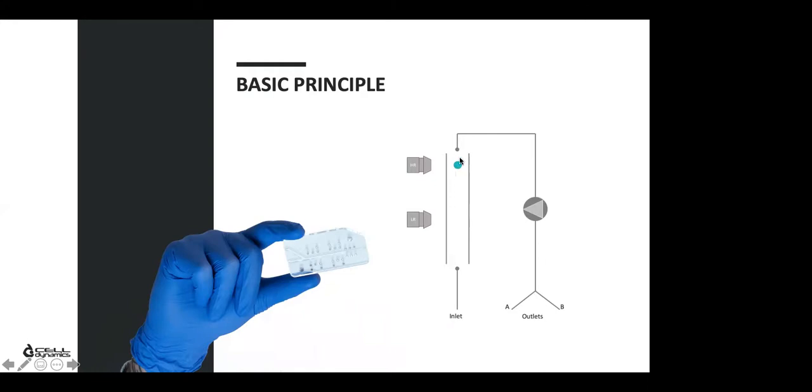The camera takes images every 100 milliseconds of the single spheroid that is falling down, and the software converts the free fall speed of the spheroids into a mass density value based on a physical law, Stokes' law. So it's basically sedimentation theory.